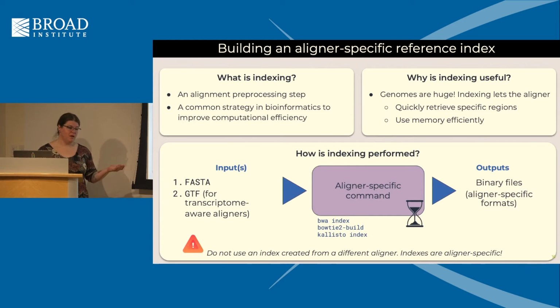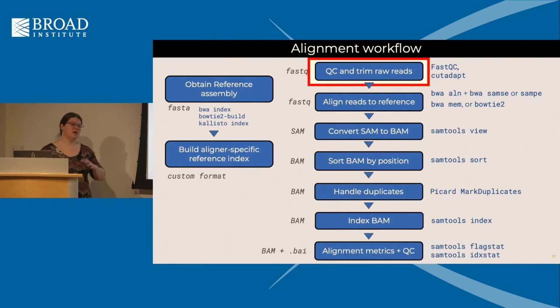So if you've been using BWA or Bowtie, and now you want to use STAR, you'll need a different reference for each of those aligners. You just make it once, and you save it. There used to be a lot in here about how to organize your directories efficiently, and I'm not going to drag you all through that, but having a directory structure like references/kallisto/HG38, references/kallisto/MM39, or GRCm39 for the new mouse genome, will make your life much easier. I highly recommend: organize your files, organize your life.